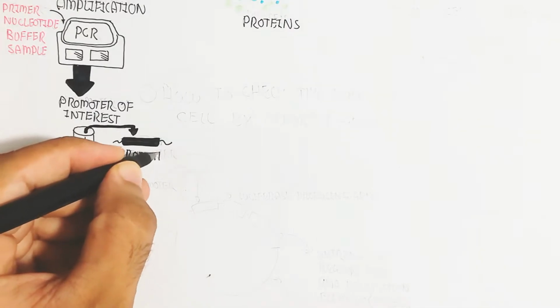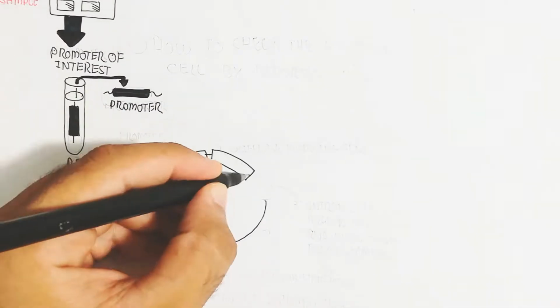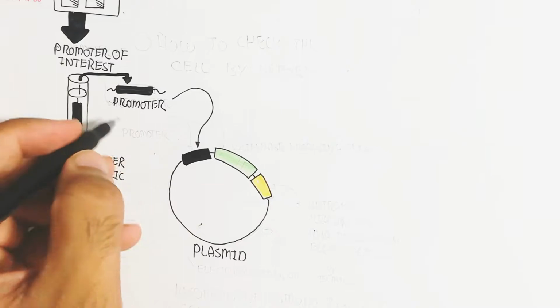This promoter of interest is inserted into the plasmid by a ligase enzyme and restriction enzyme.